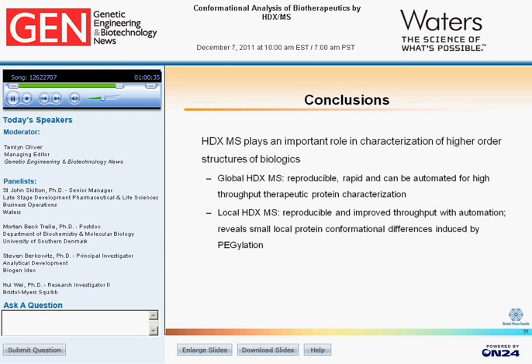It can reveal very small local protein differences induced by pegylation. Both global and local HDX-MS have great potential in biopharmaceutical industries for applications such as comparison analysis and many more.